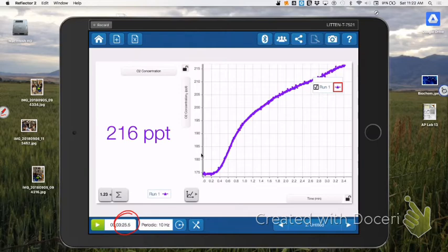All right, so now I have emptied my vial multiple times and rinsed, because that catalase tends to stay in there. This time I'm going to run a 3% solution of hydrogen peroxide and 0.5 ml of catalase. And once I've added it and set the top on, I can hit the play button in the bottom left-hand corner. And now I'm running this lab again.